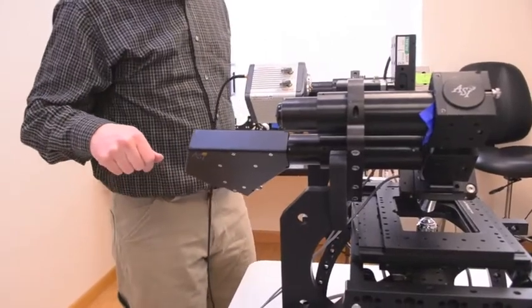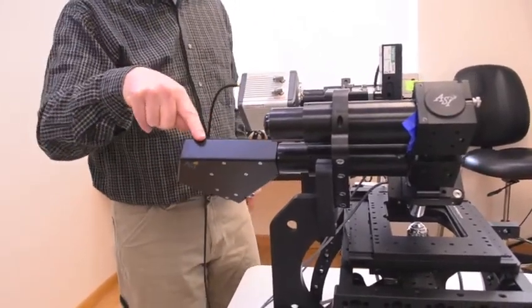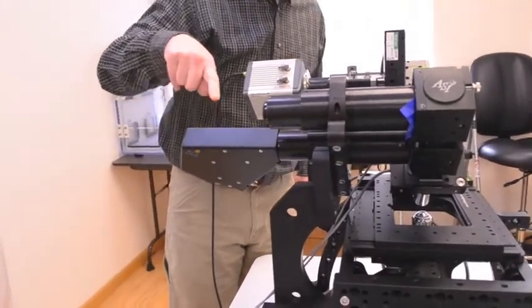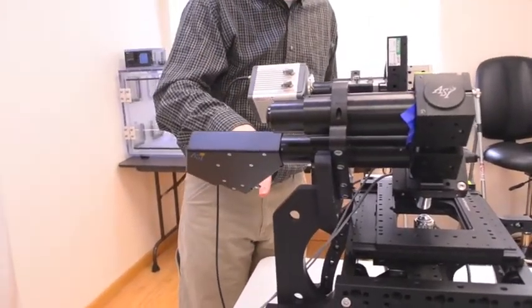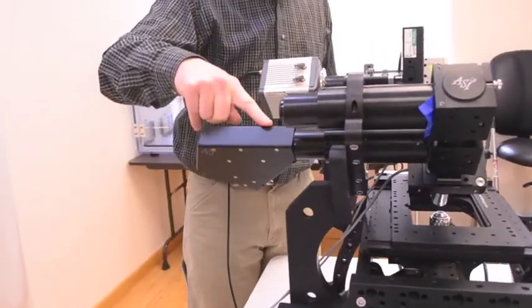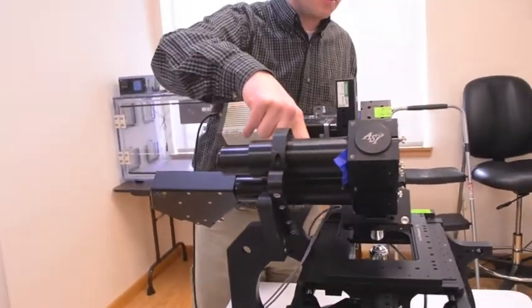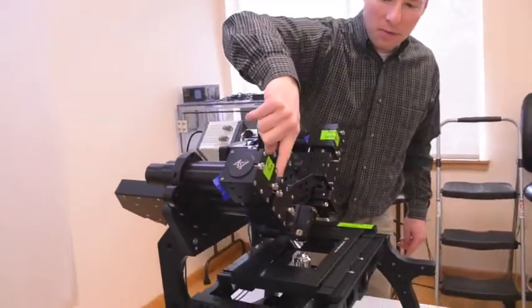So now I'm going to tell you about the DI SPIM components. We're going to start here at the scanner. This is what generates the light sheet, and the excitation beam simply comes in here on a fiber cable.